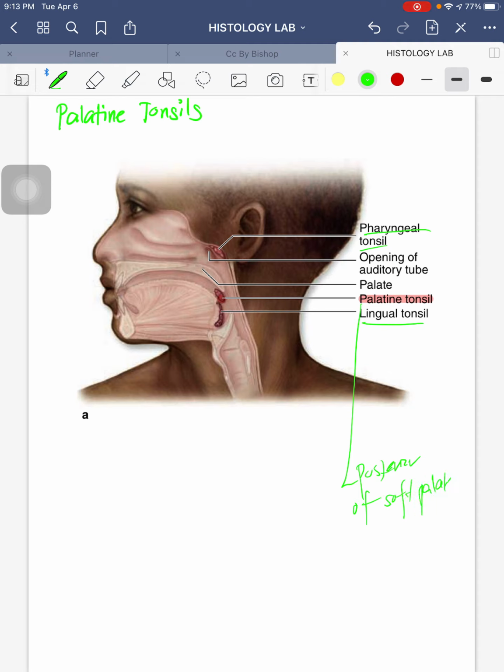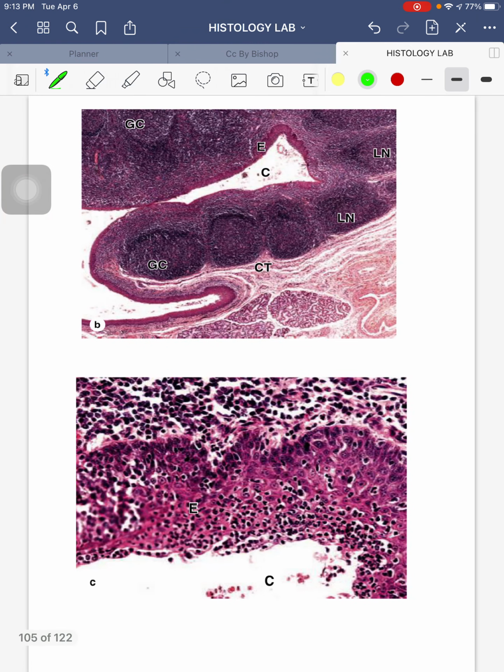Okay, aside from that, we'll tackle it one by one in the next. So this is what we'll focus on. Your palatine tonsils have crypts. This one in green. So, crypts. What are crypts? These are invaginations, deep invaginations within the organ itself. Usually a palatine tonsil, the textbook says, has at least 10 to 20 crypts.